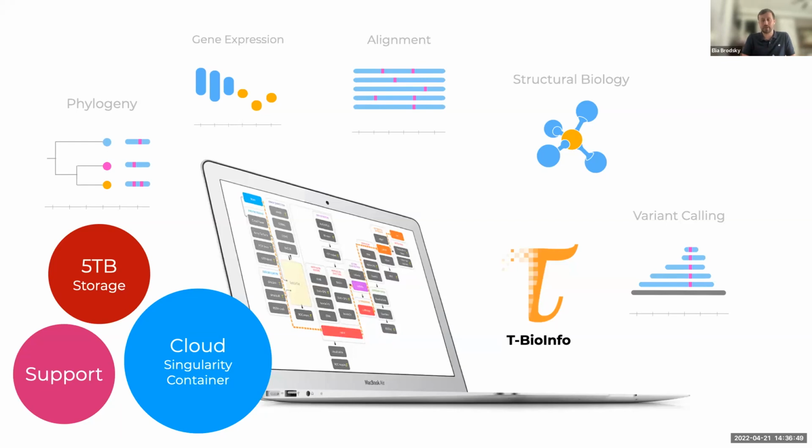And oftentimes it's not economical to try and have somebody service every step of the way. So the platform allows a biologist to be much more independent with these complex tasks, mostly for processing and getting standard outputs. But I will show you today a few examples of how you can also go into the exploratory stages and also downstream annotation.